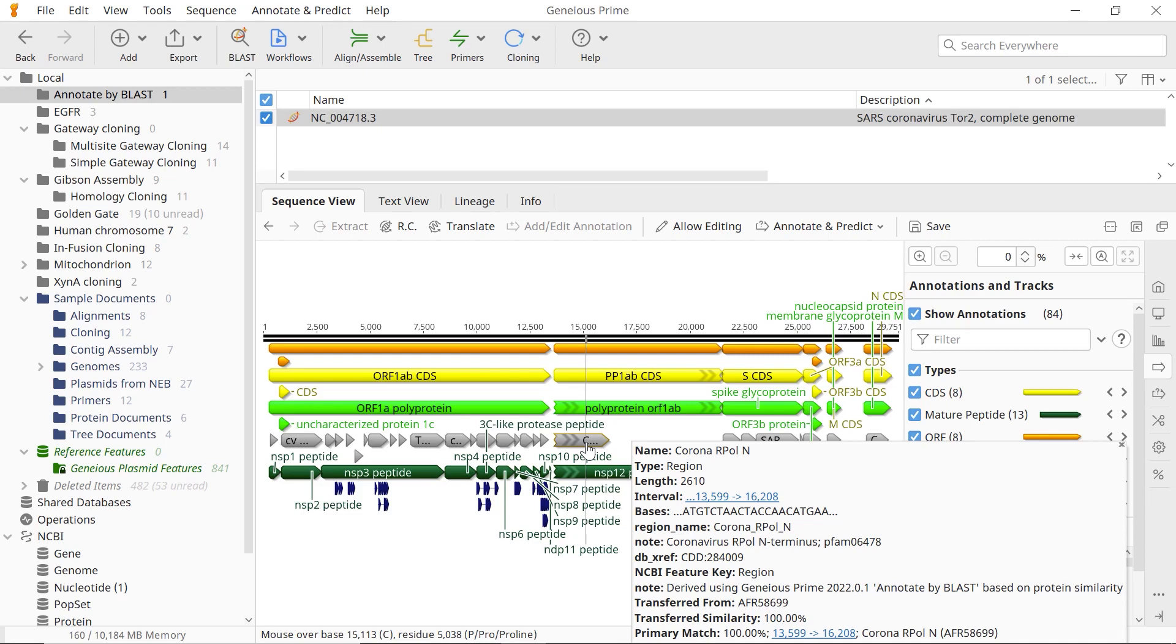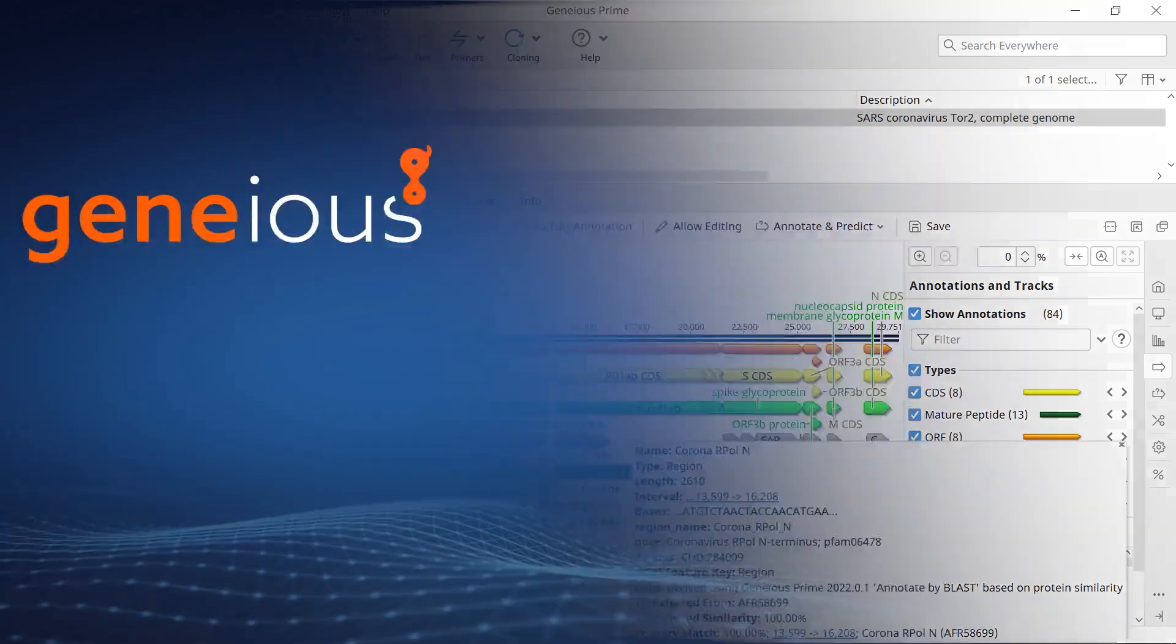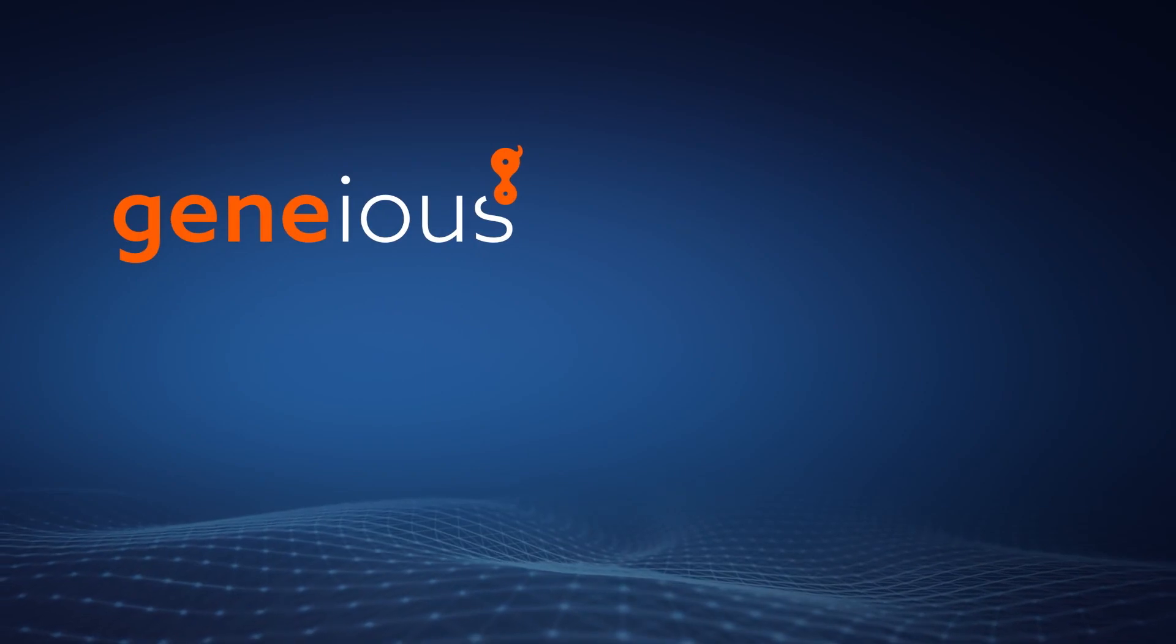One last thing to note is that the larger the BLAST database, the slower the search. So if you have a large number of annotations, use custom BLAST instead, as large searches to NCBI can be extremely slow. And that's how to annotate by BLAST in Genius Prime.